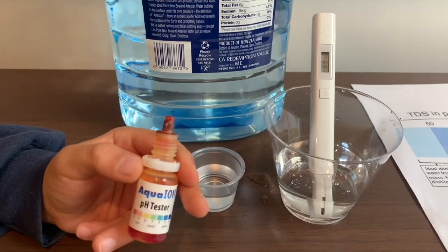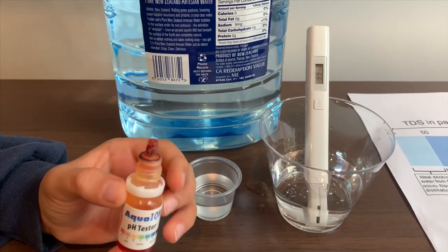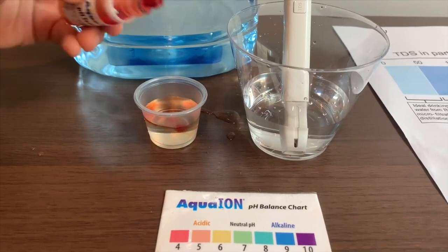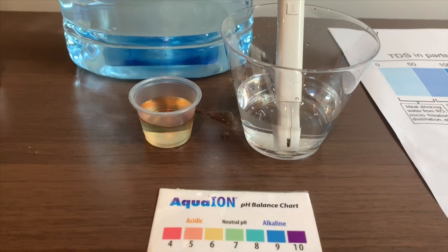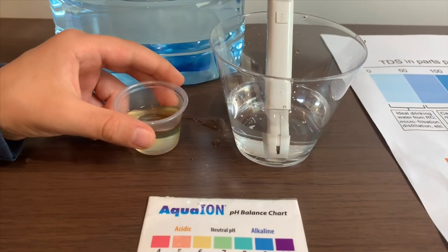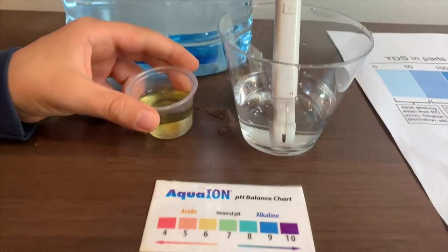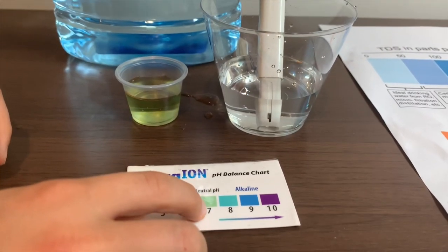If you want to buy this pH tester, check the link down below. We're going to do two drops. Let's stir it a little. This is a seven — this is a neutral pH.